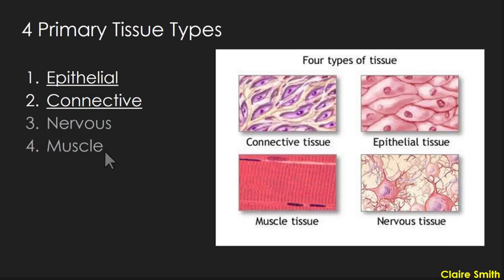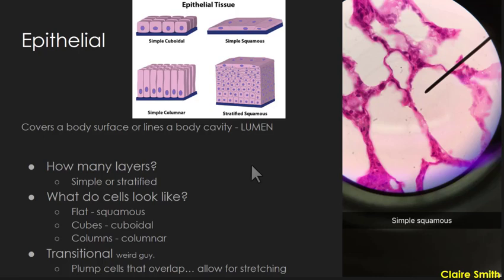So this week, the tissues that we're looking at are only going to be either epithelial tissue or connective tissue. Okay, we're not going to see any nervous tissue or muscle this week. Okay, so epithelial or connective tissue only. Okay, so starting with epithelial tissue, so the basic tissue type is epithelial, but there's a lot of subdivisions of this. Like I said before, epithelial tissue either covers the body surface or lines a body cavity. So again, the epidermis, outside layer of your skin, or the lining of your stomach, or the lining of your intestines, all will be epithelial tissue.